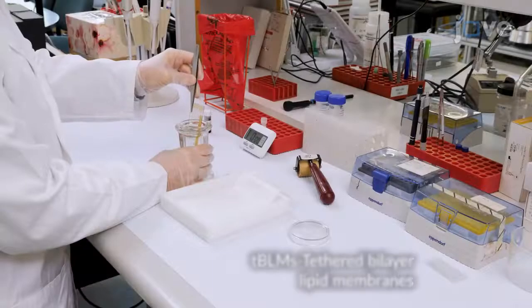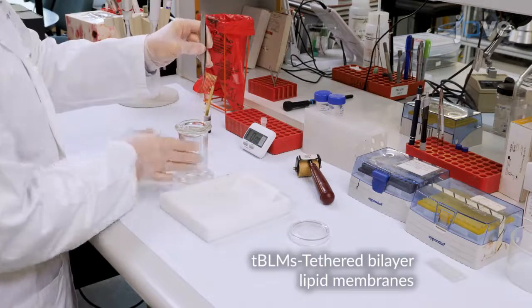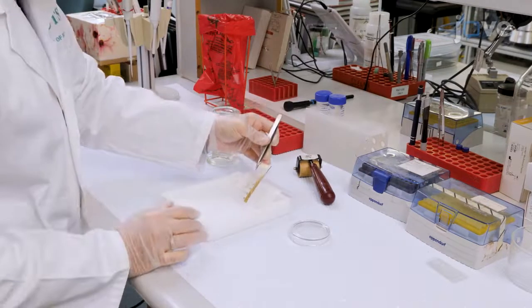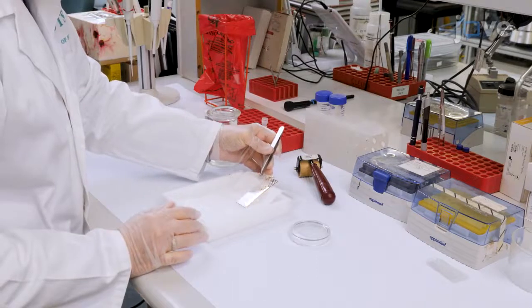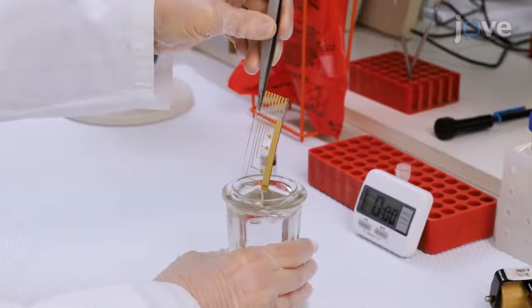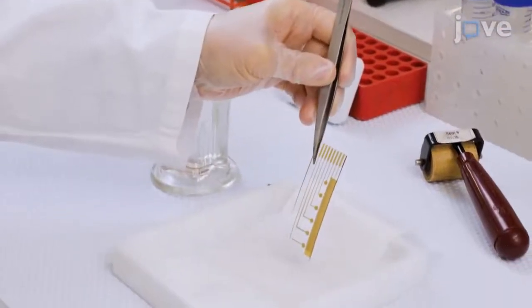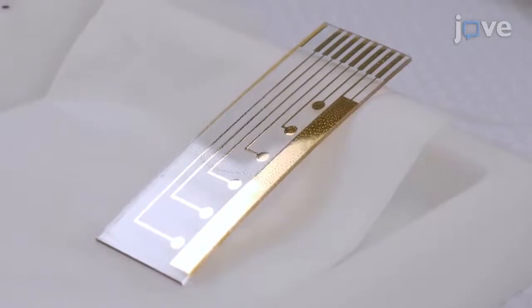To begin, carefully take off one coplanar gold electrode slide from its container using tweezers, taking care to not contact the patterned areas where the tBLMs will form. Air dry the slide for 1 to 2 minutes to remove any residual ethanol. Then place the gold electrode over a dry surface with the patterned gold surface facing up.